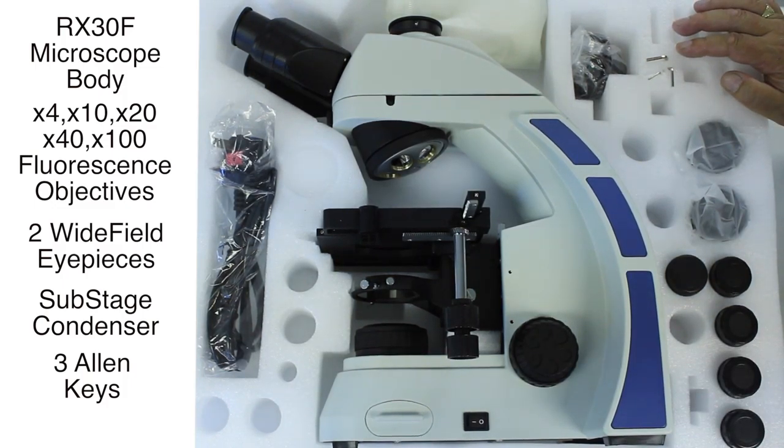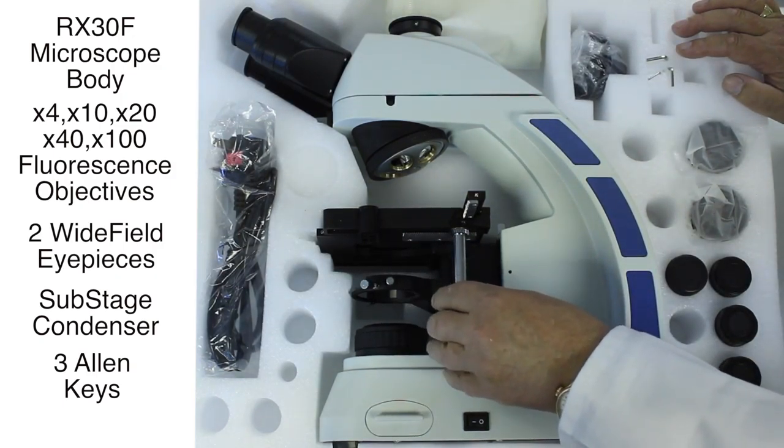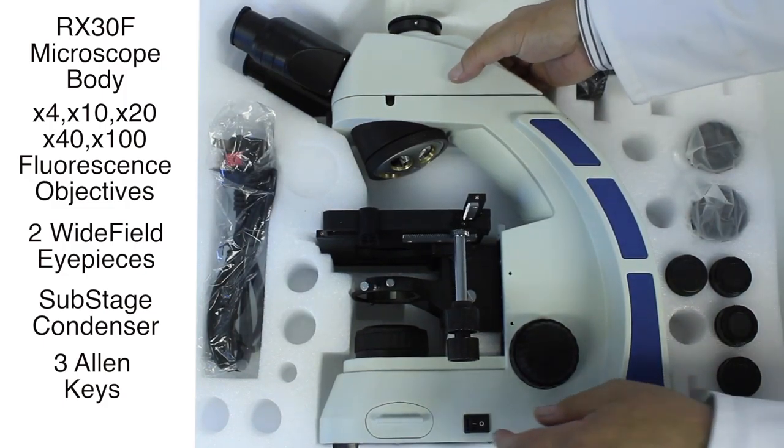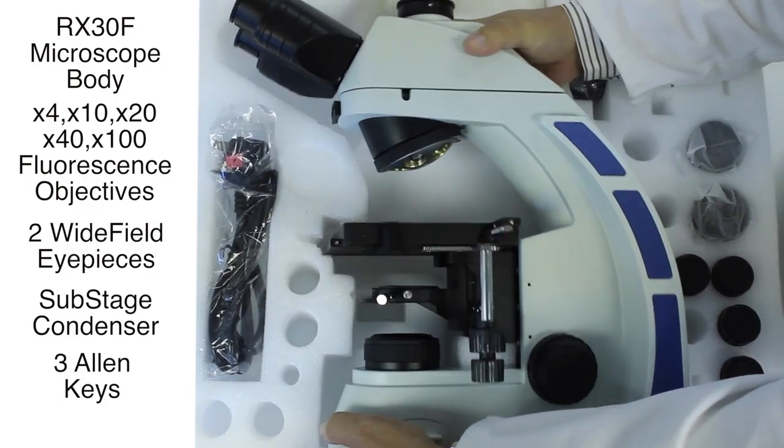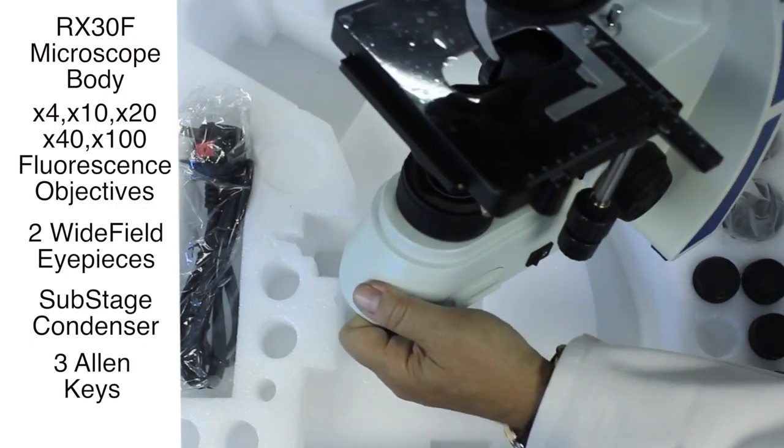To remove the microscope from the polystyrene shape, don't be tempted to grab it by the handle of the stage because it's possible you may bend it. Put one hand under the head and the other under the base and just gently ease it out of the polystyrene.